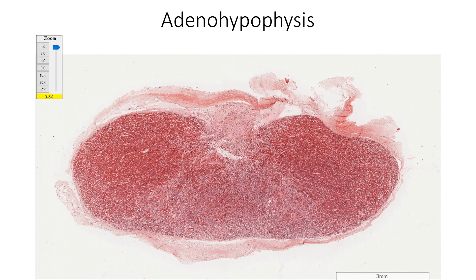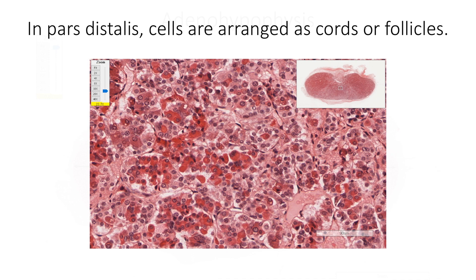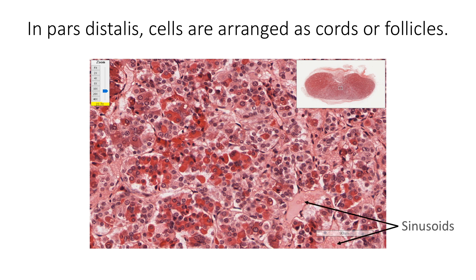All three parts of adenohypophysis are made up of glandular epithelium. Pars distalis is the largest part, showing a central portion and two lateral wings separated by vascular trabeculae. Cells in the pars distalis are arranged as cords or irregular follicles, with clumps of cells separated by sinusoidal capillaries lined by fenestrated endothelium.